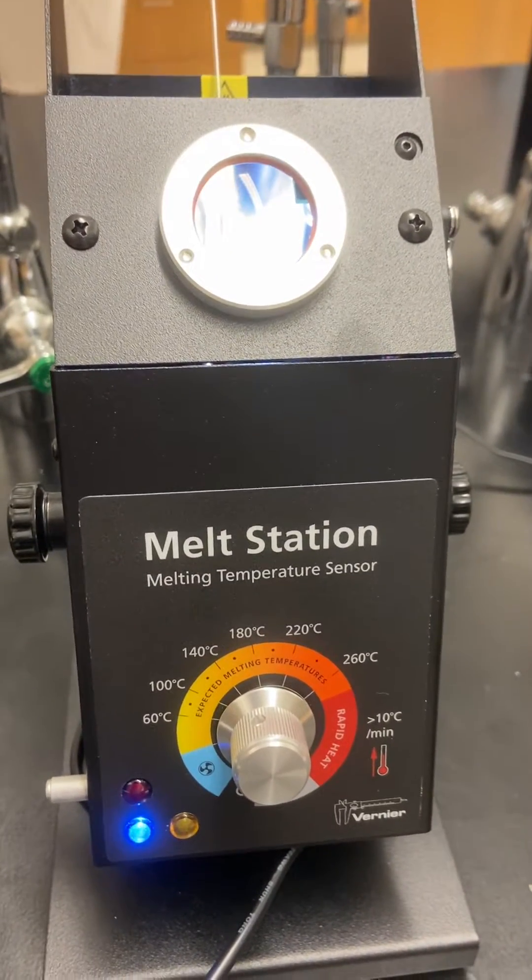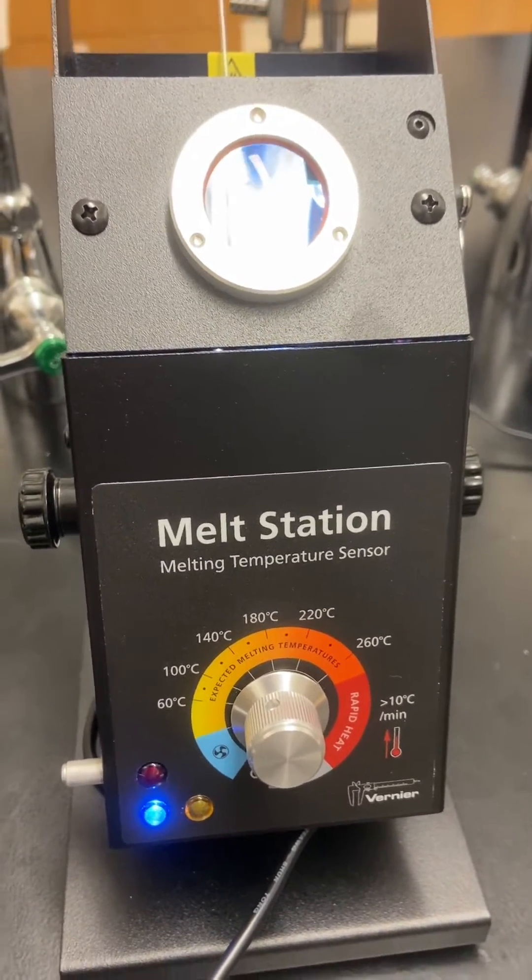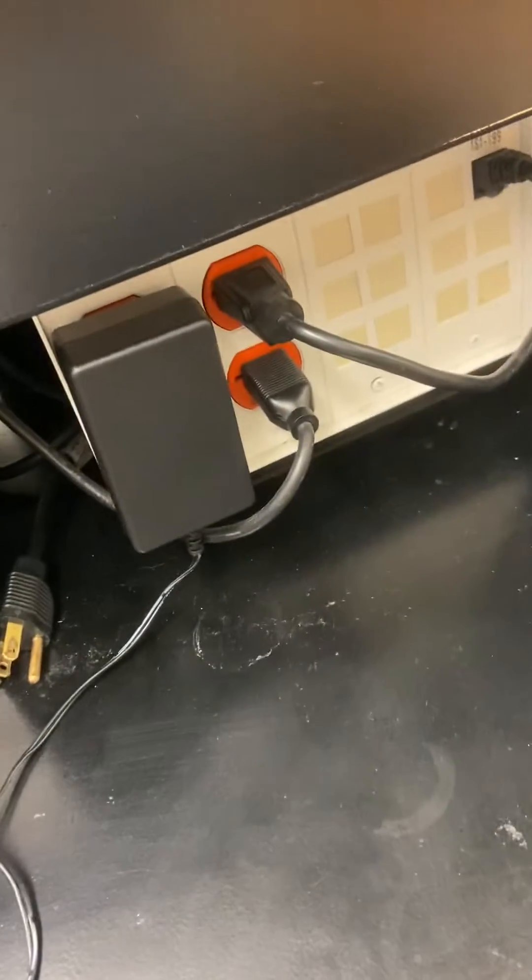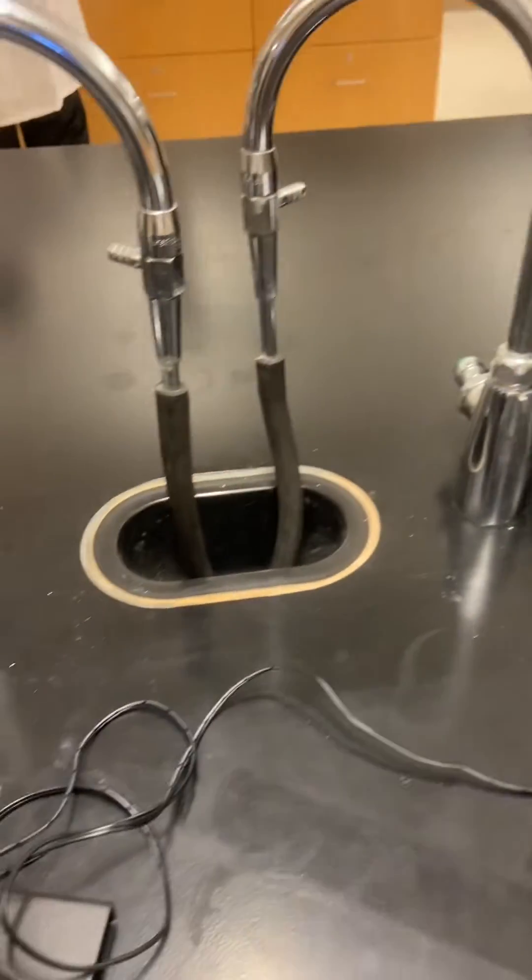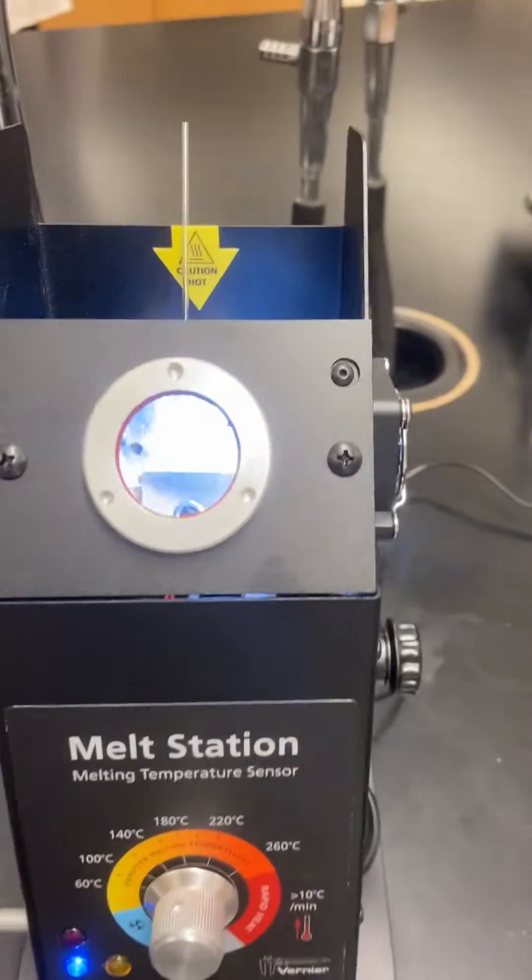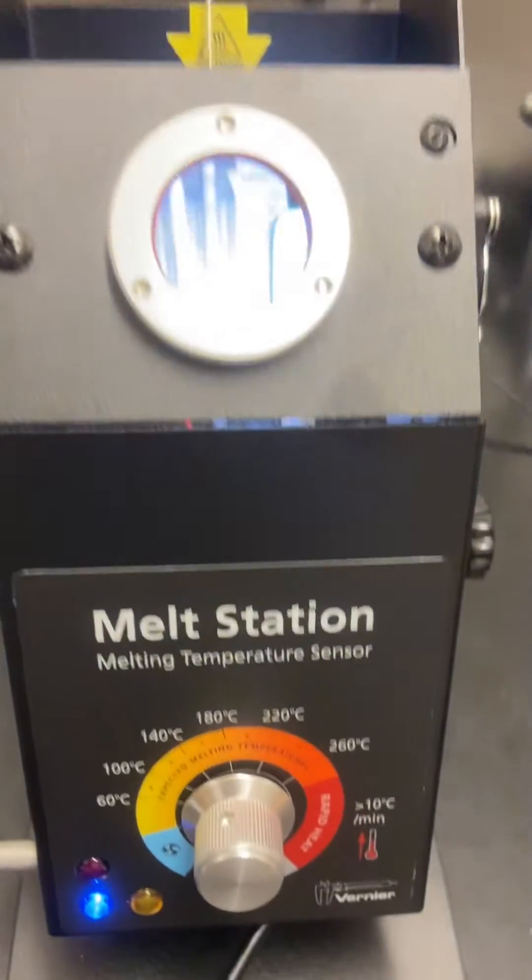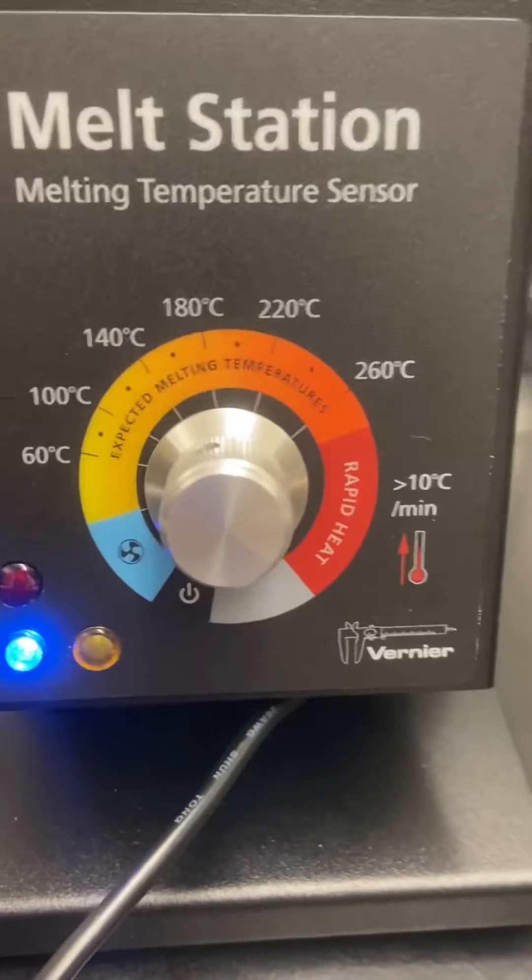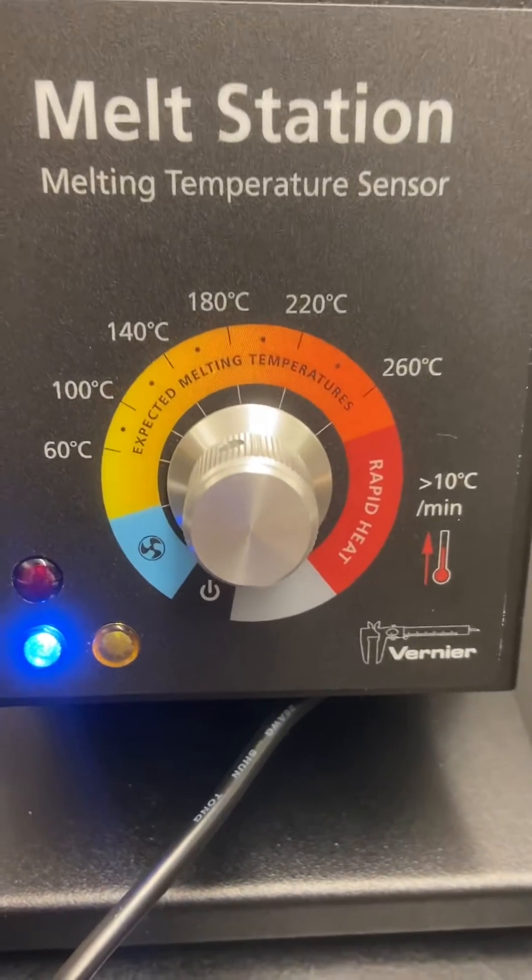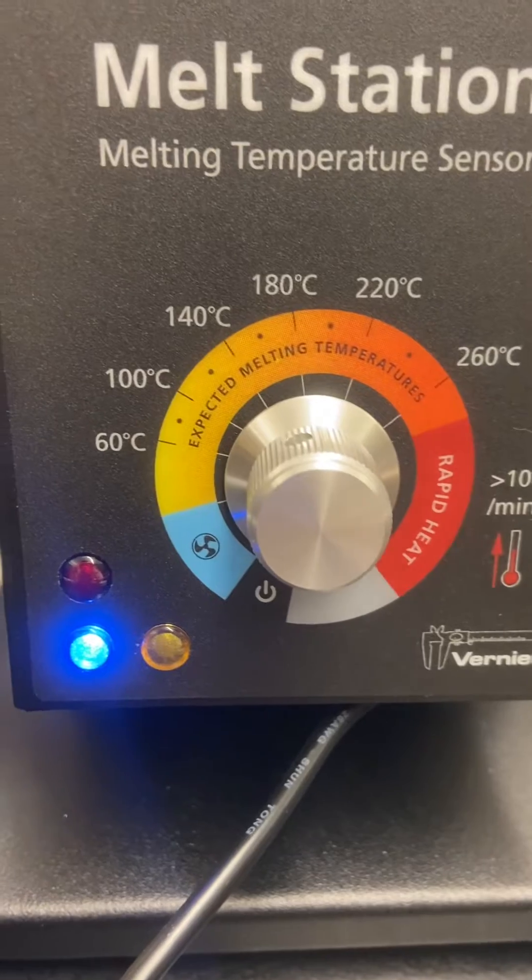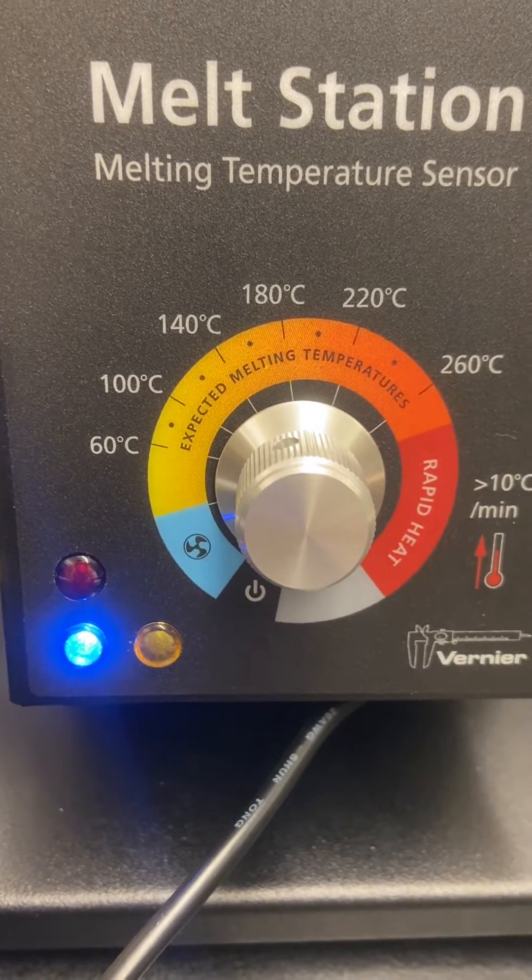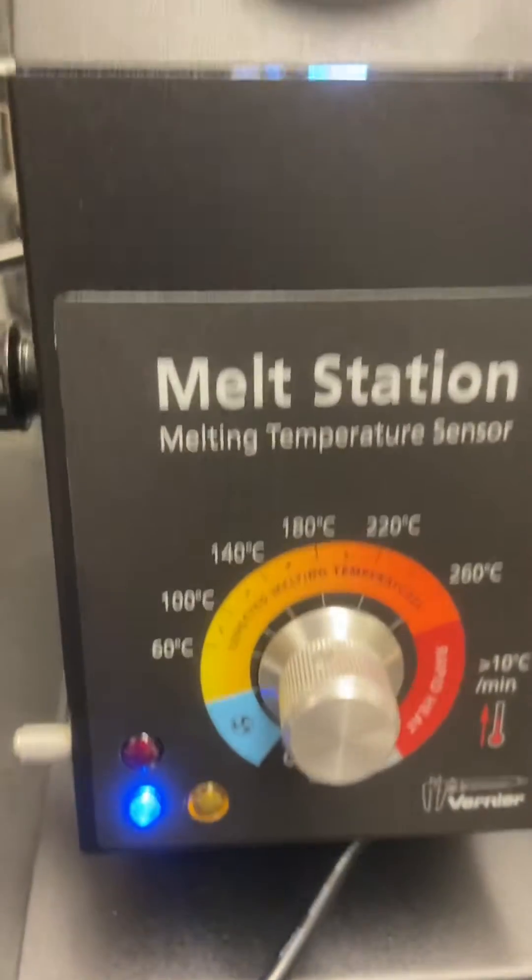This is a Vernier melt station. It's powered on. Over here is the power cord, and we have different temperature ranges here. The blue region is to cool the melt station down.